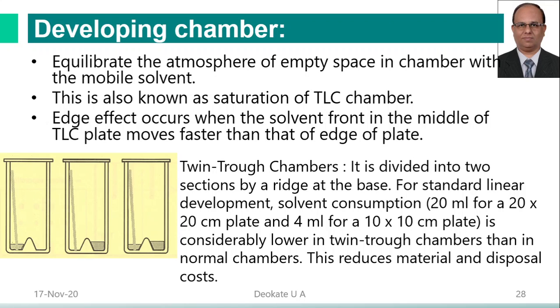Edge effect occurs when the solvent front in the middle of the TLC plate moves faster than that at the edge of the plate. This is due to non-saturation of your mobile phase chamber atmosphere. So you need the atmosphere to be well saturated, otherwise it will cause the edge effect.